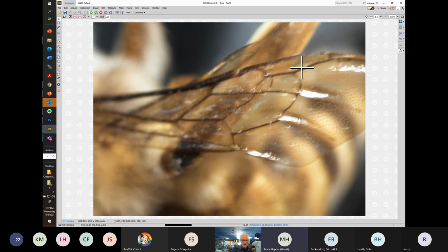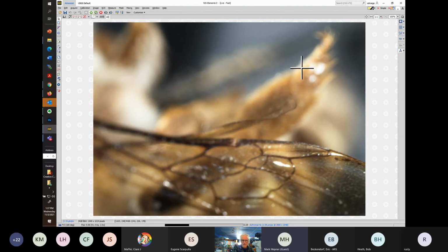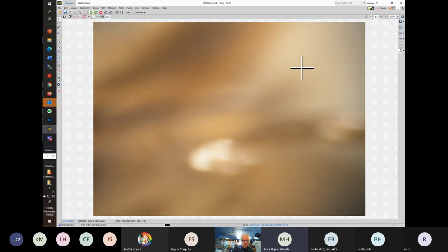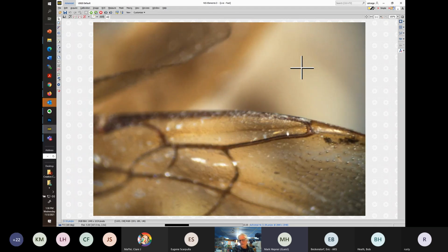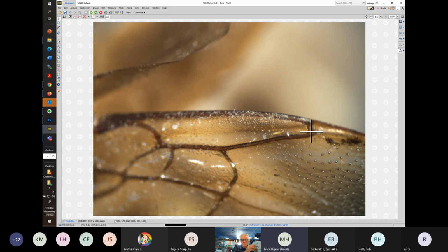If we look at the tip of the marginal cell, often used in separating out big groups, but a little bit tricky, we will see where the tip is. In this case, it seems like that's kind of cut off, so it's a little ambiguous. That could be the tip. It could be angular. We might ignore that for now.